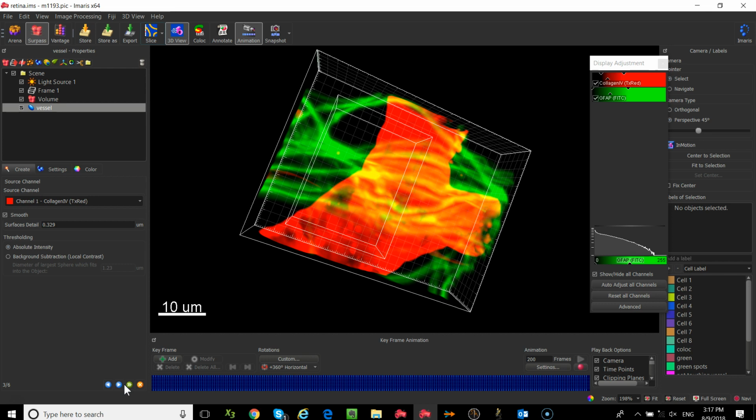I'm then going to have you switch to a different data set, and we're going to go through the other mode, which is called background subtraction, because I want you to understand the difference between the two and when to choose one versus another. Now, we have one vessel, one continuous vessel in this data set, and for the most part, it's the same intensity.